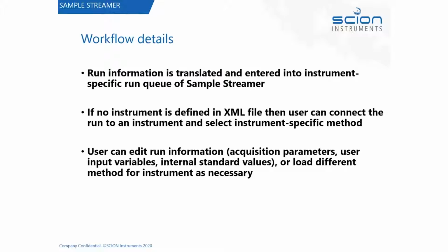So you can have this kind of halfway house where the LIMS is controlling everything and determining all of the run parameters, or you can have it that the LIMS is only scheduling what samples have to be run, and you leave the actual instrument selection or additional details to the operators. So you can have what's called a kind of mixed mode of operation, or you can run it purely manually where everything is controlled by the operator from the user screen.